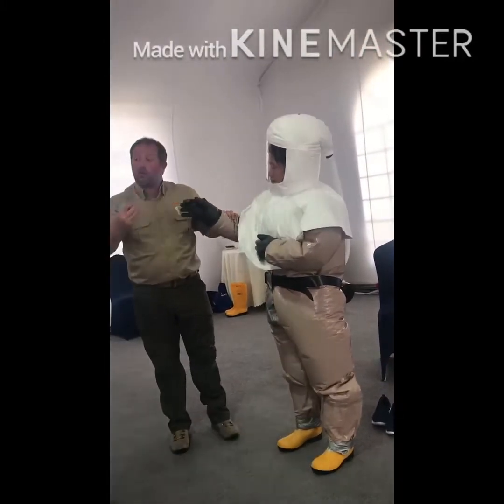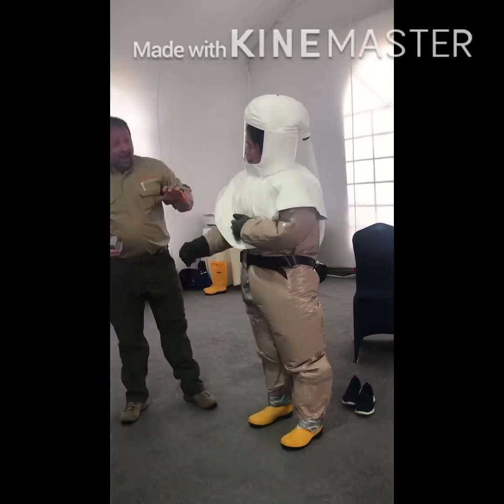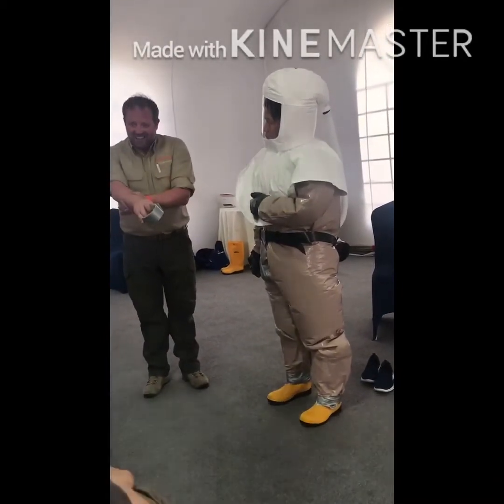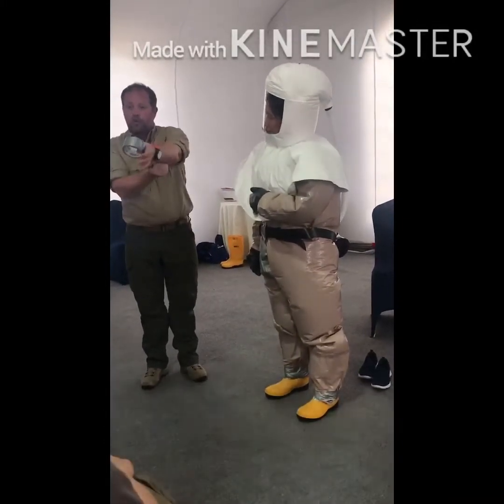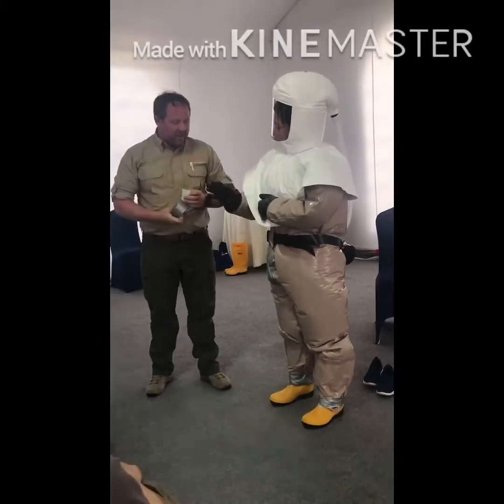So the training suits, as an example, don't have this. If we don't have integral gloves, I'd wear one pair of gloves inside the suit, then put the suit on, second pair of gloves goes over the top, and then tape. And then last thing I'm going to do with my tape, turn around for me.